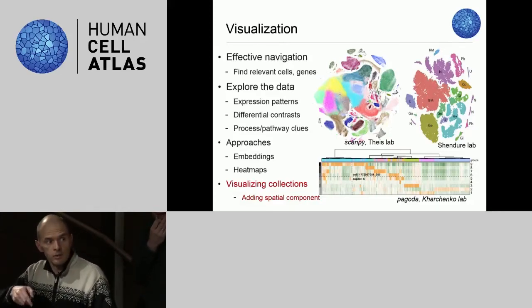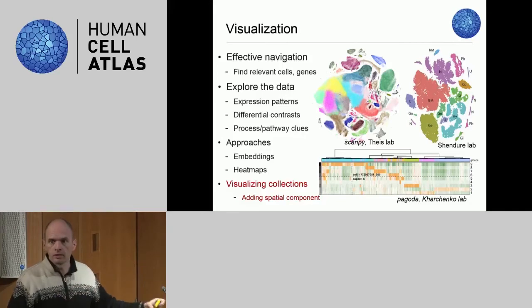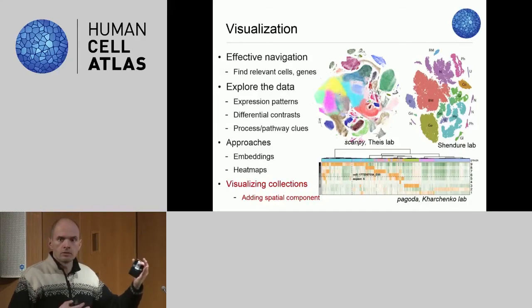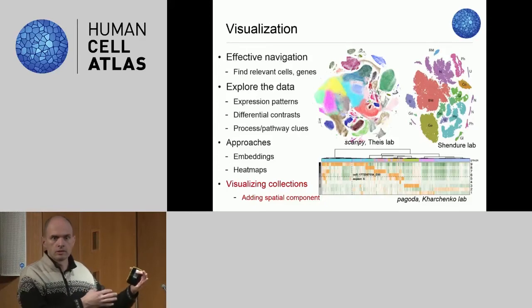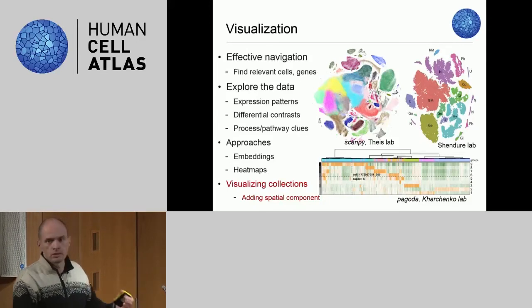Furthermore, as we heard in the previous talk, the spatial methods will add a lot of context to what's being shown here, with different cell types and clusters. Ideally, you would like to be able to visualize and navigate both in spatial dimensions, in tissue organization anatomically, and in tissue organization transcriptionally.